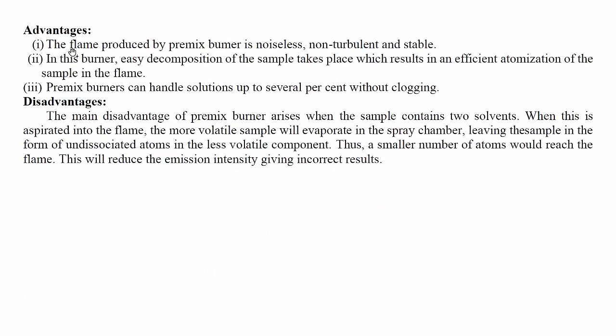Advantages. 1. The flame produced by the premix burner is noiseless, non-turbulent and stable. 2. In this burner, easy decomposition of the sample takes place, which results in an efficient atomization of the sample in the flame. 3. Premix burners can handle solutions up to several percent without clogging.